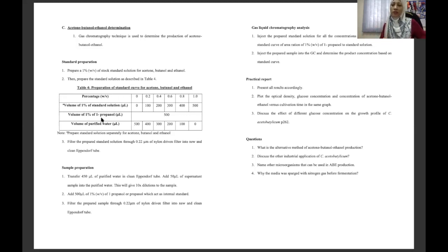You need to have this internal standard. So what is the purpose of adding it? That is mentioned as a control. It is actually to make sure that your sample or your standard is prepared correctly. When you analyze it using GC, you supposedly get two different spectra.